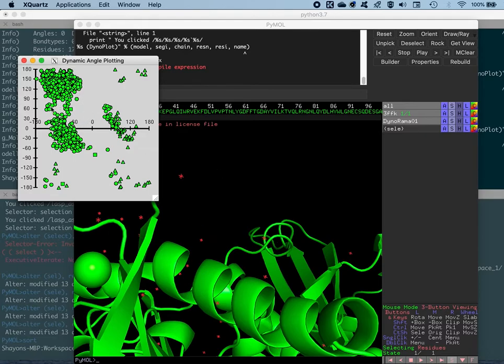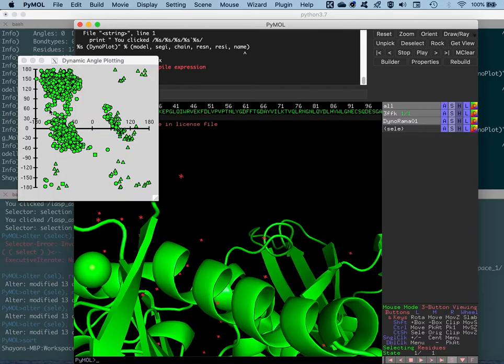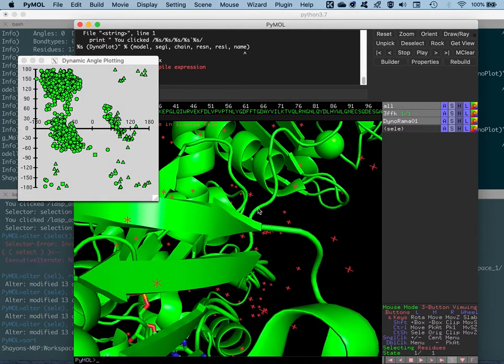Whereas if you go ahead and click a residue somewhere here, let's say this guy, then you will find that this actually occupies the beta sheet region, which is the designated beta sheet region out here. Okay, so that's that. So next what we are going to do is basically go ahead and designate it by chain, or color all of these residues by chain.